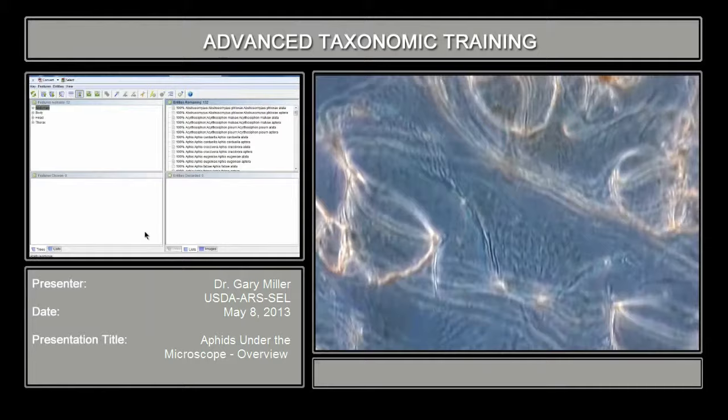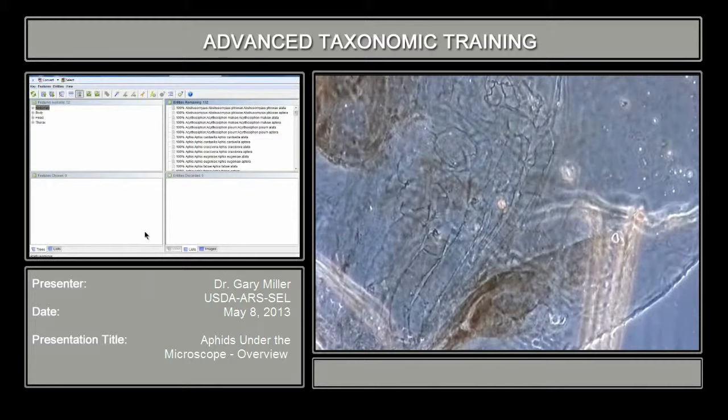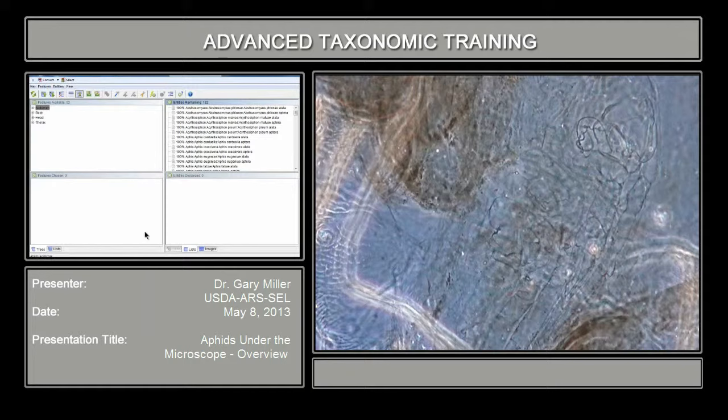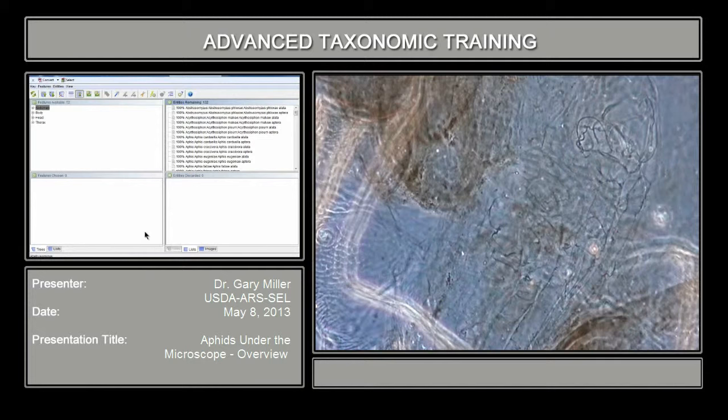You can see the sculpturing on that abdomen. This specimen is notable in that it has an embryo inside. In some groups, embryos are diagnostic. By and large, immatures are not used, but occasionally some groups use embryos for species identification. That's also a good check if you're not sure whether you have an immature aphid: if you have embryos in its body cavity, that's a good sign that you're working with an adult.